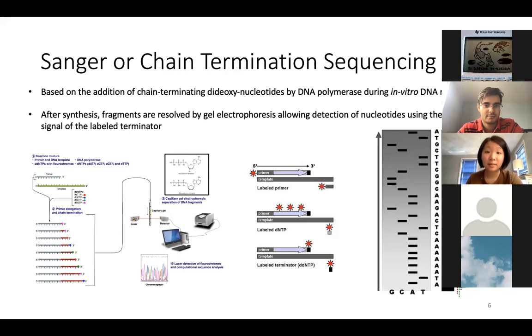For the normal nucleotide, at least, the DNA sequence will keep on replicating. But when you have the one without the hydroxyl group, then the complementary chain, or the DNA sequence, will terminate, because the nucleotide can't continue on.